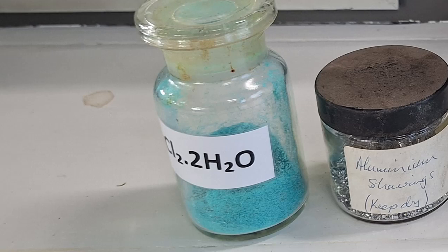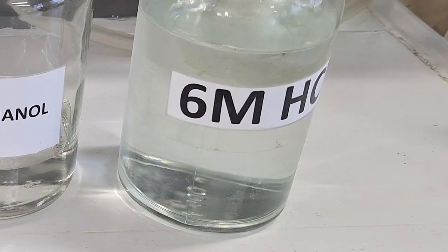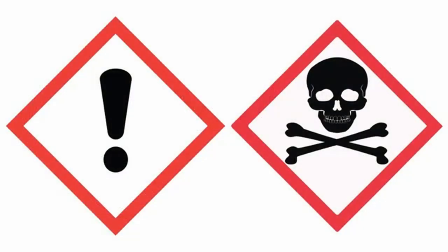Be careful, as copper compounds are toxic irritants, methanol is flammable, and hydrochloric acid is very corrosive. These danger signs appear when picking up different chemicals. See your manual for what they mean.